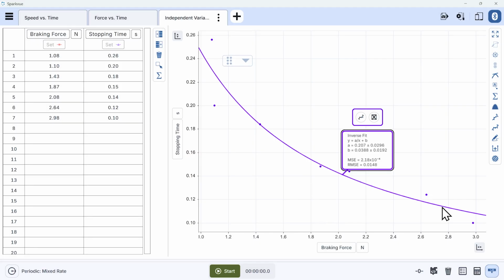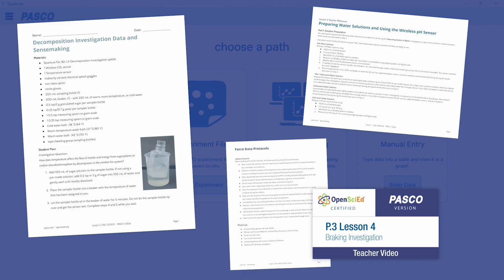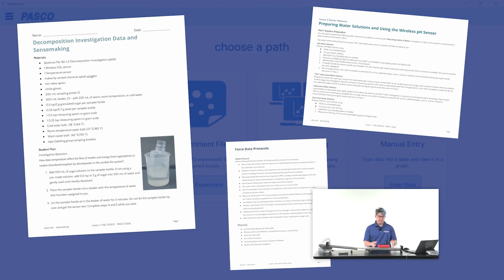We hope this overview has provided a helpful orientation to the SPARKvue features used across multiple high school activities. Don't forget to look to the written or video procedures for a specific activity for detailed instructions, including on using any specialty SPARKvue features beyond those covered in this video.